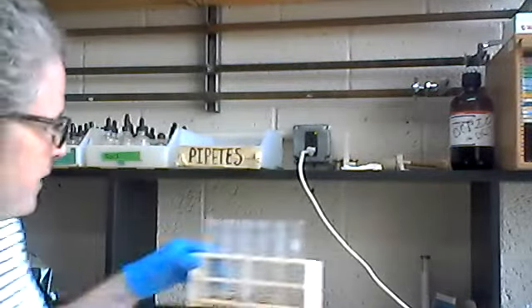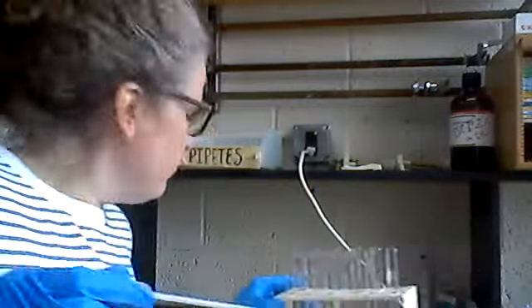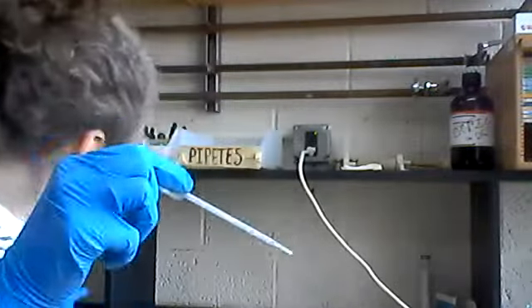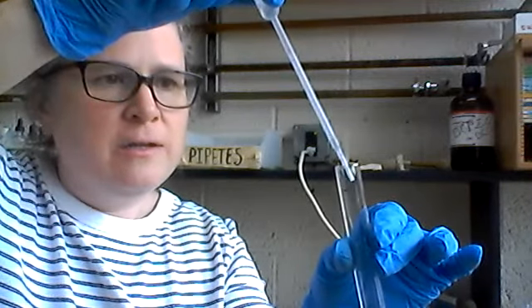Okay, so our last test is the Biuret test for proteins. So for this one, slightly different. I've got 1.5 milliliters of each of our substances here, and I'm just going to add 1 milliliter of Biuret reagent, which I have here, but I'm using a graduated pipette, and because you add it just a drop at a time and kind of shake it after each drop, I want to make sure that I'm adding it properly.